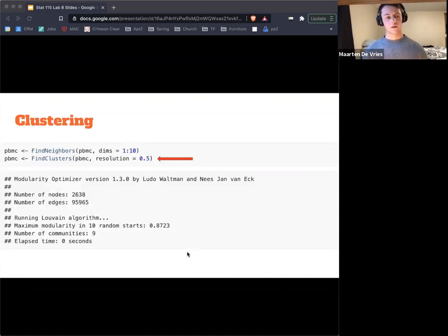So clustering is also very conveniently implemented using the find neighbors function. This embeds the cells in a graph structure, for instance k nearest neighbors, with edges drawn between cells with similar feature expression patterns. And then it attempts to partition this graph into different communities or clusters.